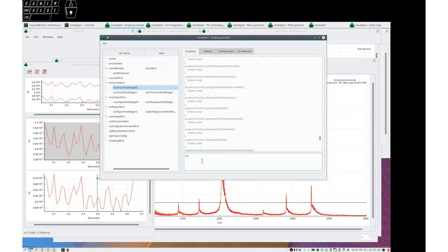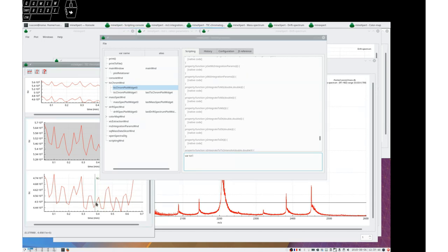For example, let's say var tick chromatogram plot trace one for this one equals that trace.